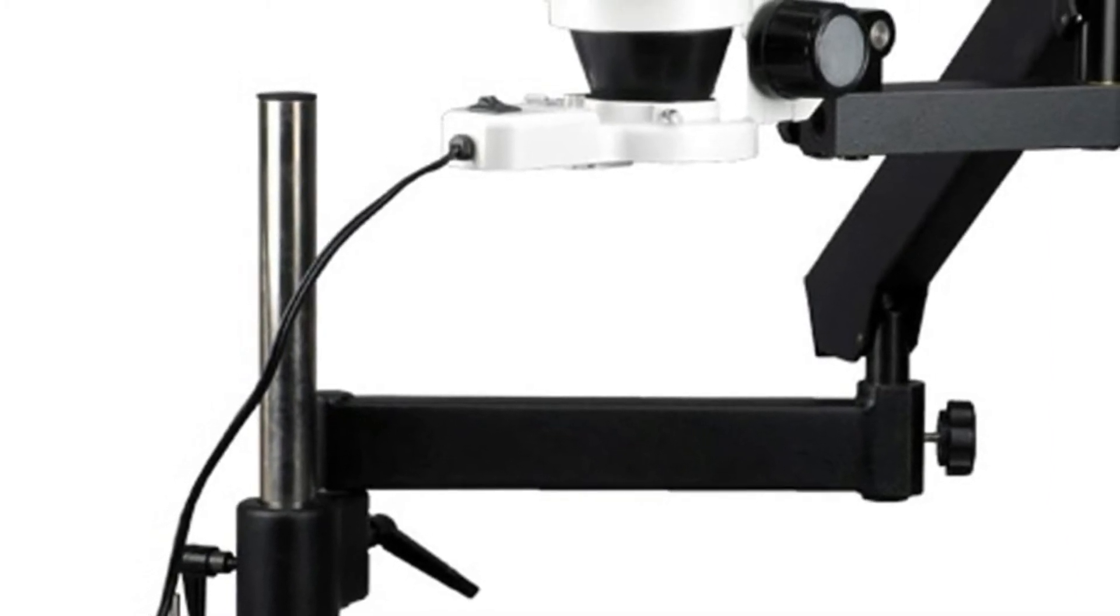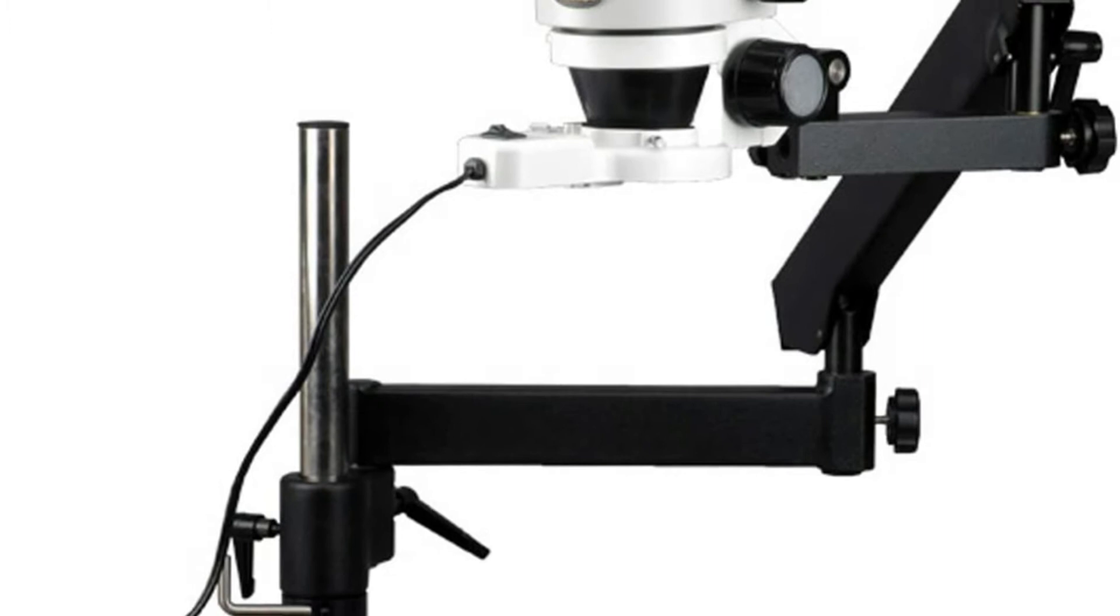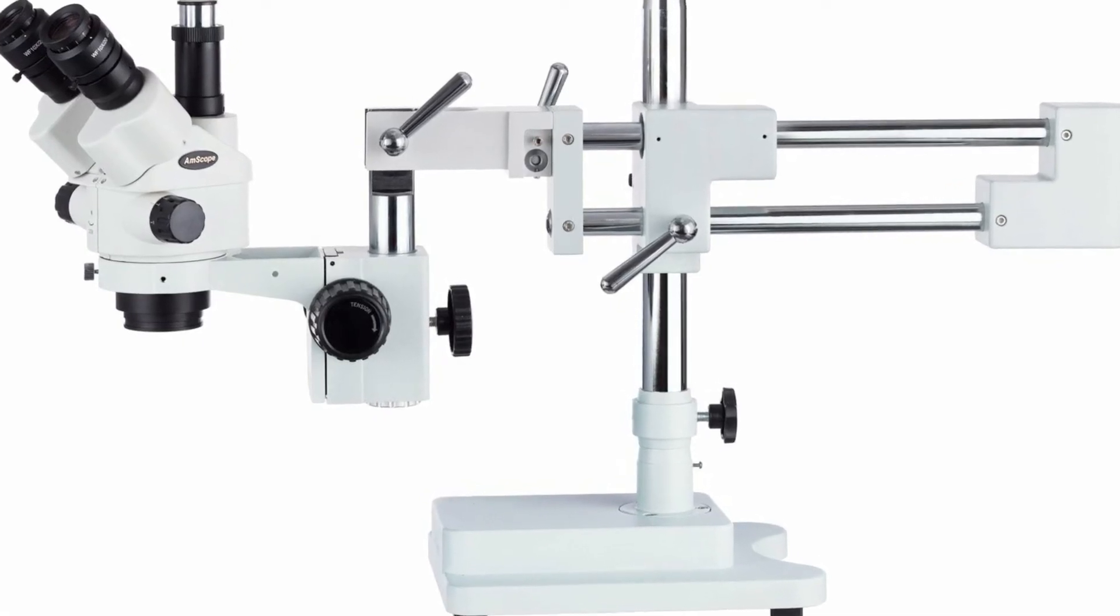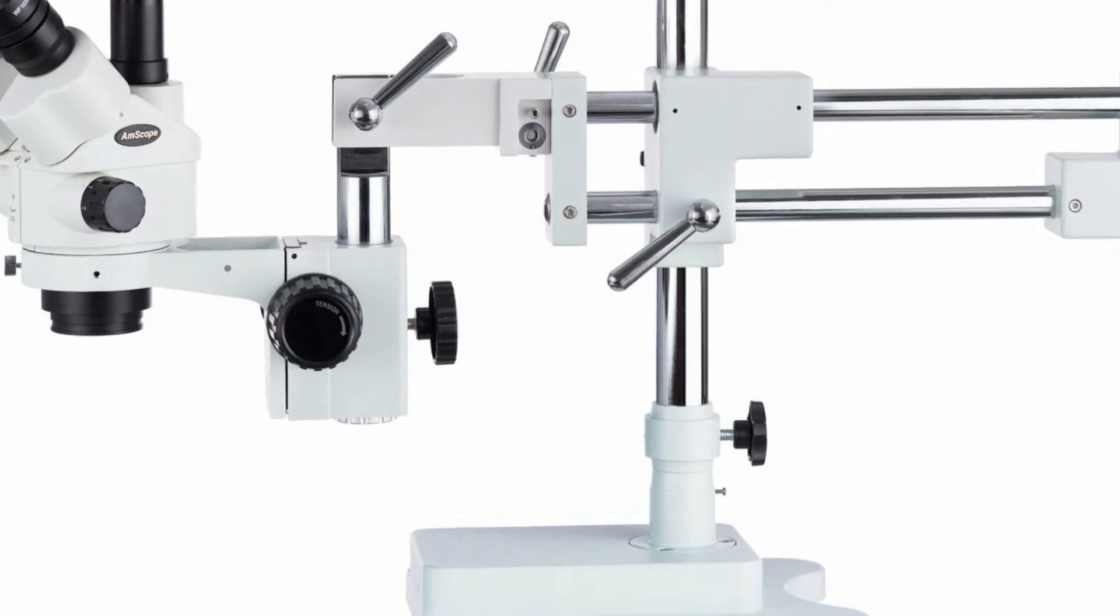With 0.7x to 4.5x zoom objectives, moving through the magnification range is as easy as turning a knob. A zoom lock allows the objectives to be set to a consistent magnification when needed.